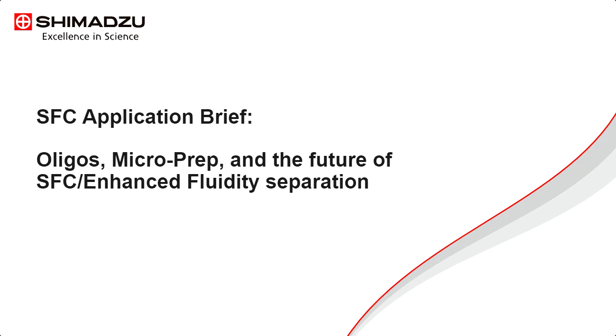As our last set of applications to consider, I'd like to look at some new and emerging applications, particularly around oligonucleotides, microprep, and how we think about SFC and what enhanced fluidity really means.